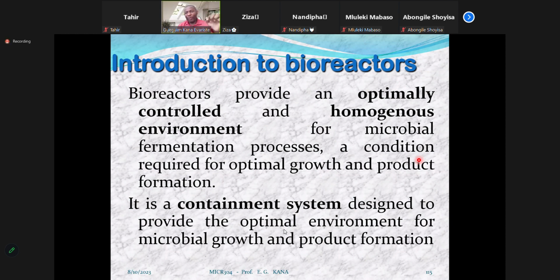You don't want too much sugar at the top of the drum and maybe zero sugar at the bottom. It has to be uniform, homogeneous. We don't want too many cells accumulated on one side of the drum, whereas the other side has nutrient without cells. We don't want too much oxygen towards the cells at the bottom of the drum, whereas in the upper part you have a more anaerobic environment. You want the same of everything in all parts of the reactor's content.